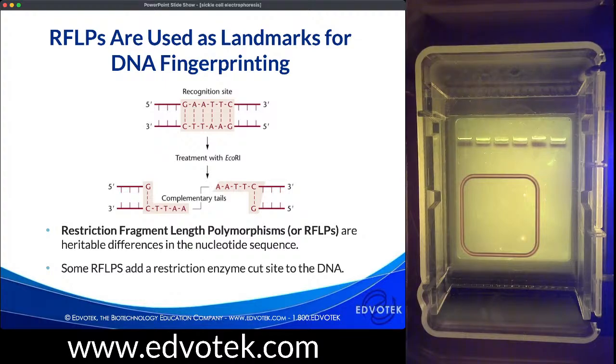For example, as we can see on this slide, the restriction enzyme EcoR1 cuts DNA with the sequence GAATTC. Let's say that that second A is where a SNP can occur. It can be an A or a T. And the enzyme will only cut when the DNA has an A in that location, because it relies exactly on that GAATTC sequence.